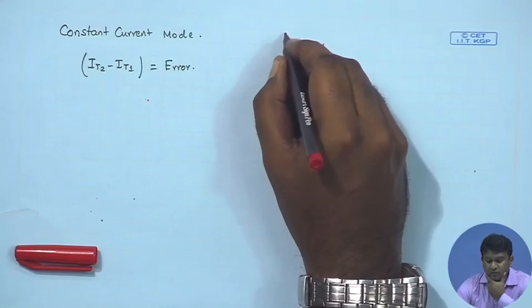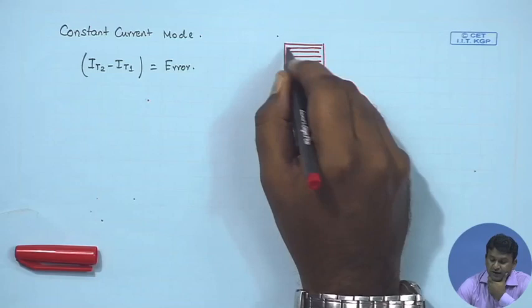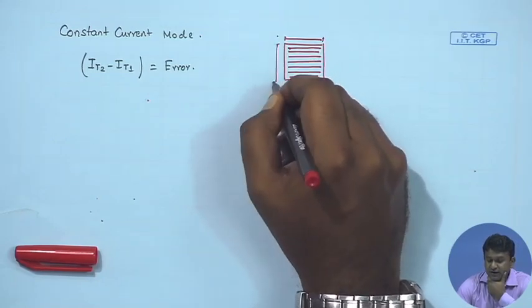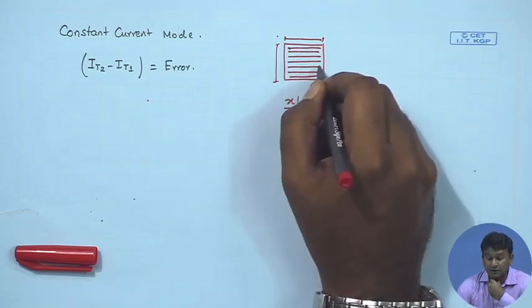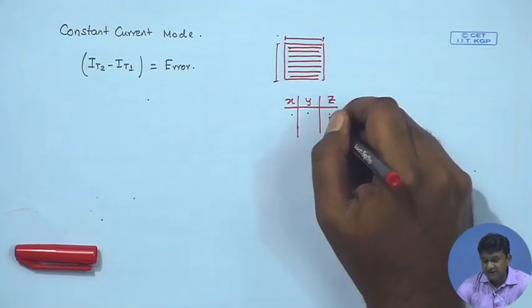It is like this rastering over a zone of interest. So, it is a 2D area, let us say from here to here is x, it is y. So, the tip simply moves along the routine of a nested do loop and it gathers the data.